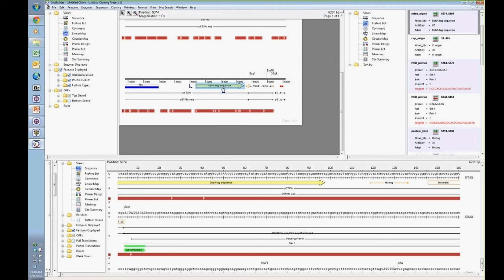While I'm in the linear view, as you can see, I can actually drag these and change the manipulation where you want this to be shown. You can also detach feature labels. This is editable. Another thing, what I call a global feature change.